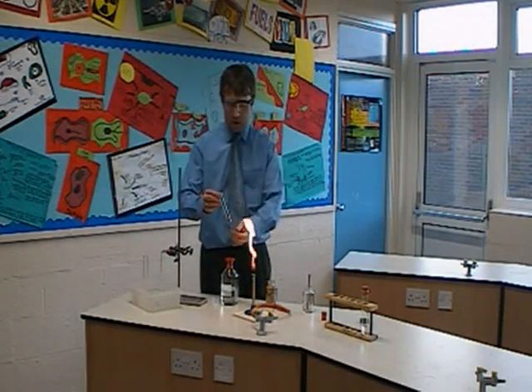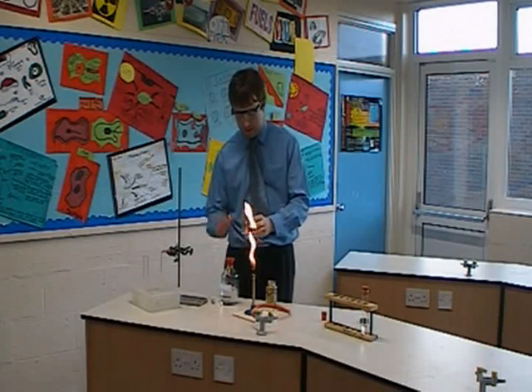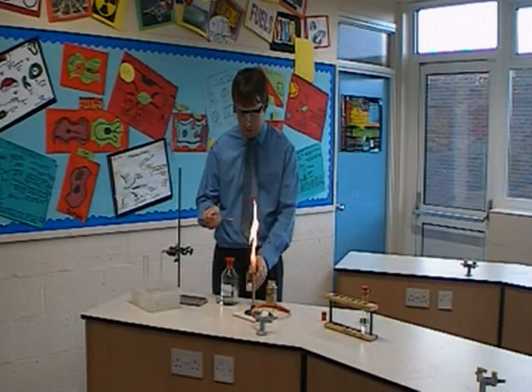The next bit, which is quite tricky, is to add a catalyst. What we're using as our catalyst is some broken crucibles, which act as the catalyst. I'm just going to use a spatula to get some broken porcelain parts and add it to the test tube.